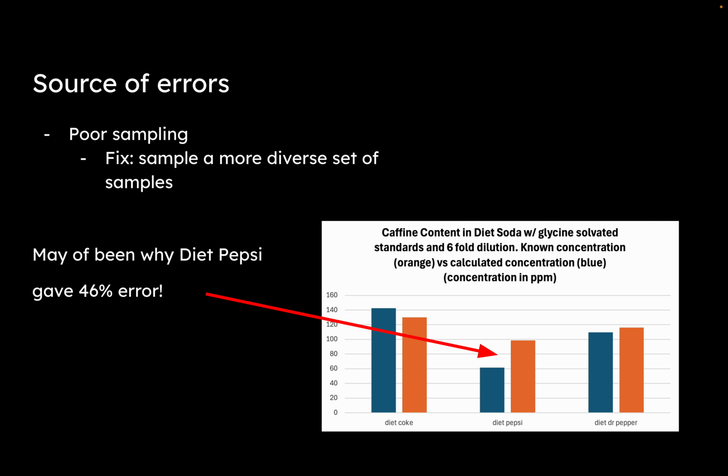So what I would want to be doing next, if I wanted to further this work, I would take many, many samples. I'd go around many types of stores if the budget was allowed and pick out different types of these sodas, in cans, of course, because that's what we're looking at specifically. So look at these canned beverages and get a good representative sample of the population, right? In the case of my project, I just didn't have that. And I think that's a fundamental flaw that we all will suffer with in our presentations here.